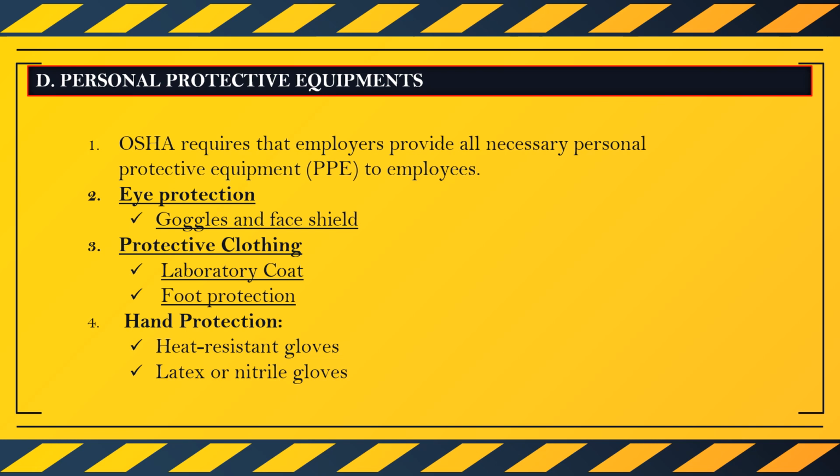So as for footwear protection, this is designed to, of course, prevent injury from corrosive chemicals or heavy objects. So if a corrosive chemical or heavy object were to fall on the floor, the most vulnerable portion of the body would be the feet, right? So for this reason, shoes that completely cover and protect the foot are worn inside the laboratory.